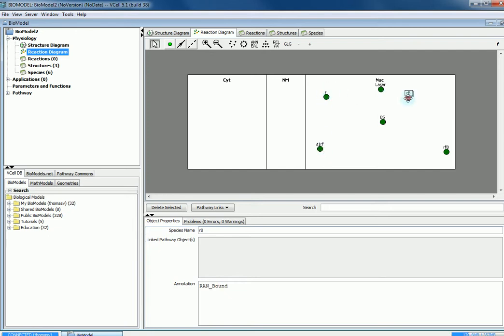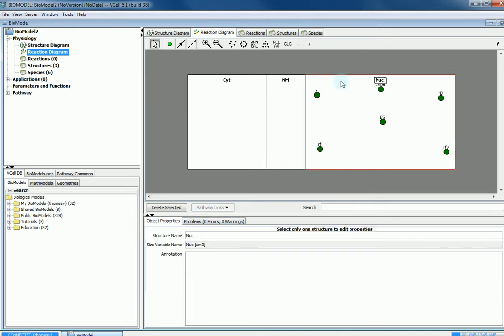And for this particular reaction diagram, this setup works very well. And this one, I'm just going to delete the S1 that didn't get overwritten the first time. And so now this is a good way to organize them, and now we can actually create the reactions.